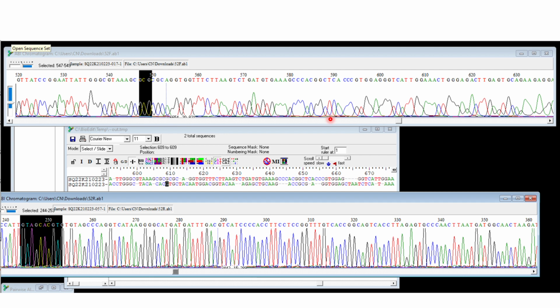So I would recommend that during formation of a consensus sequence, especially for 16S, we can see that the enzyme becomes weaker as it tends to the end. So it tends to produce less quality sequences compared to the beginning.